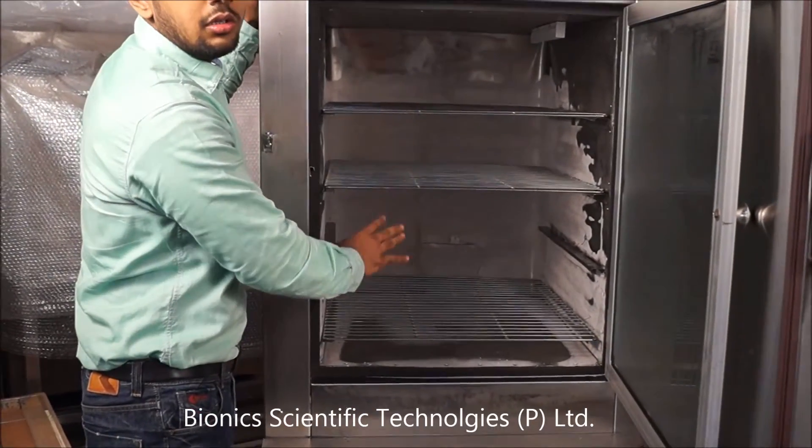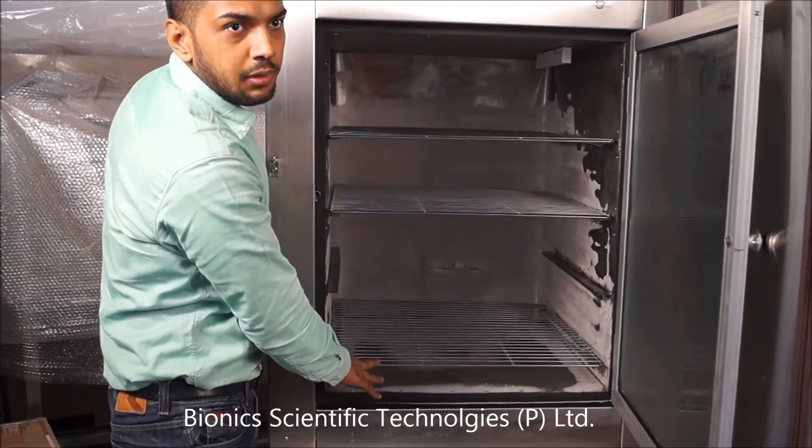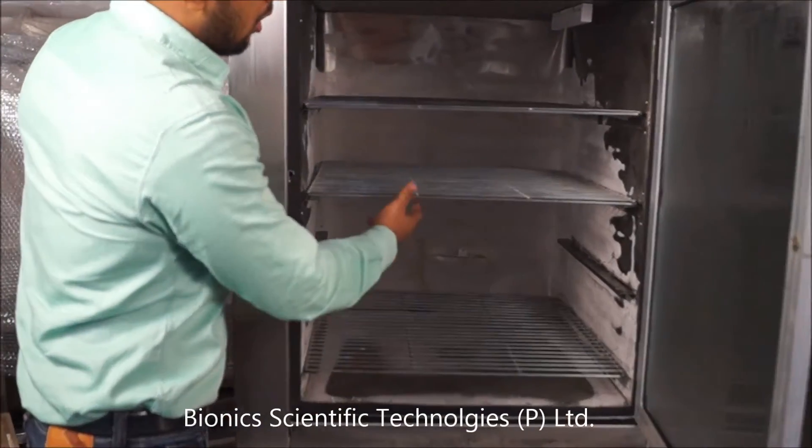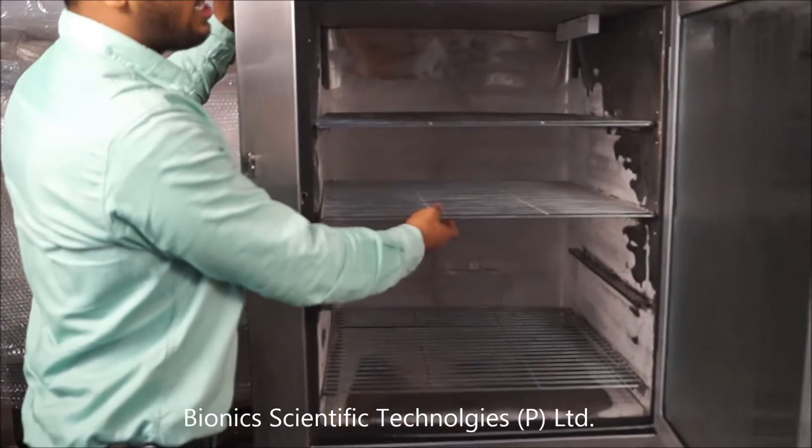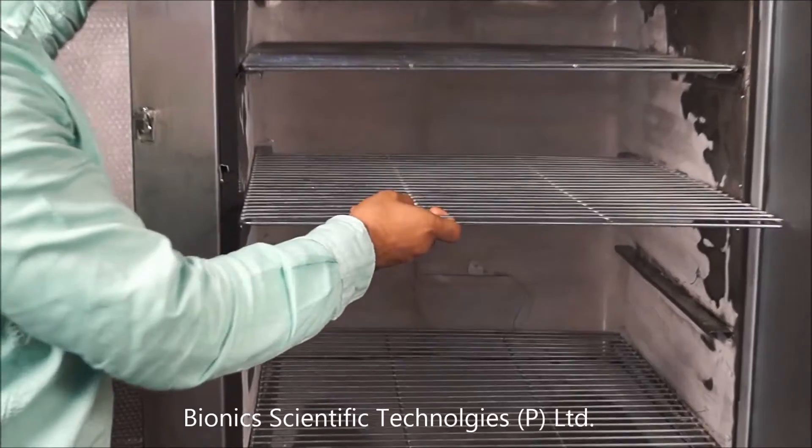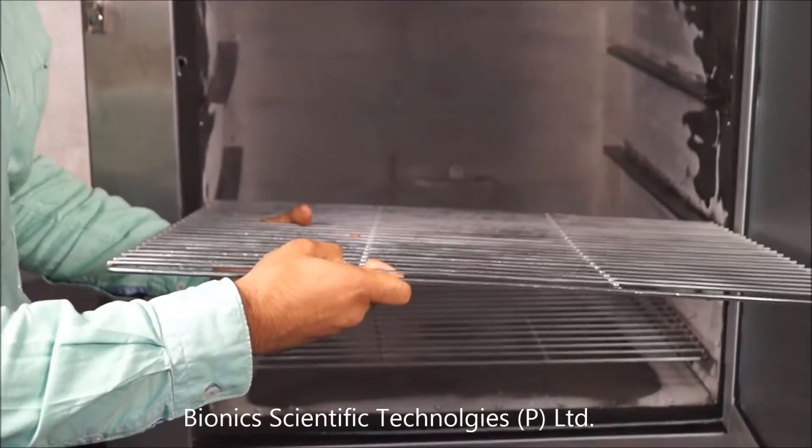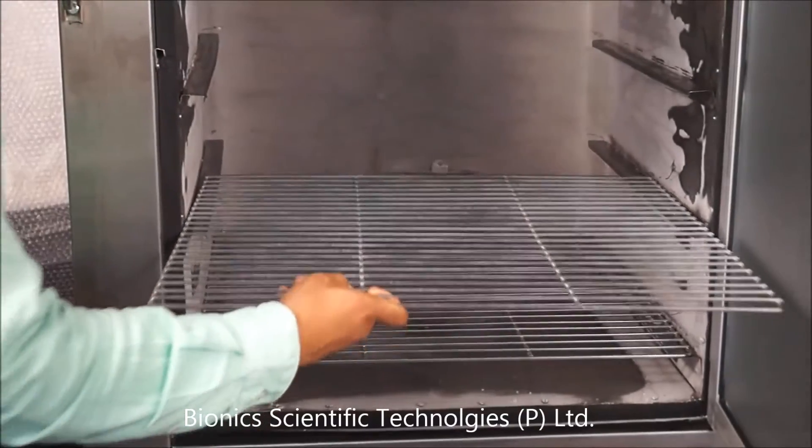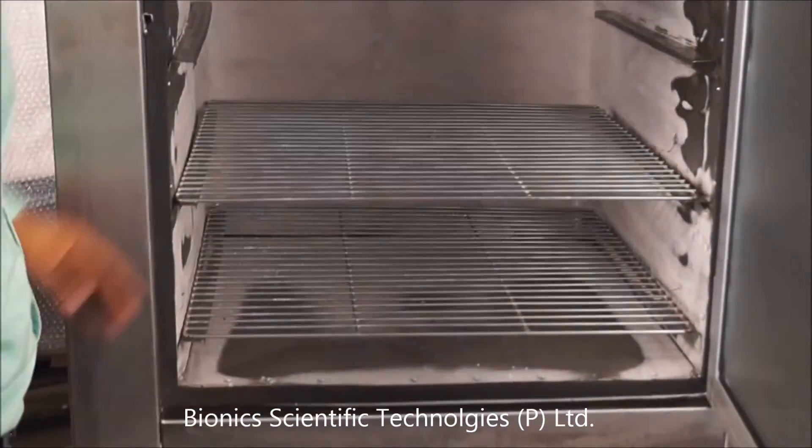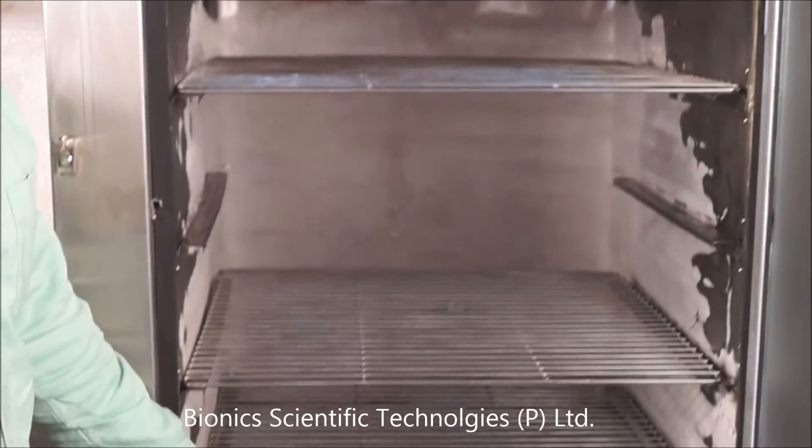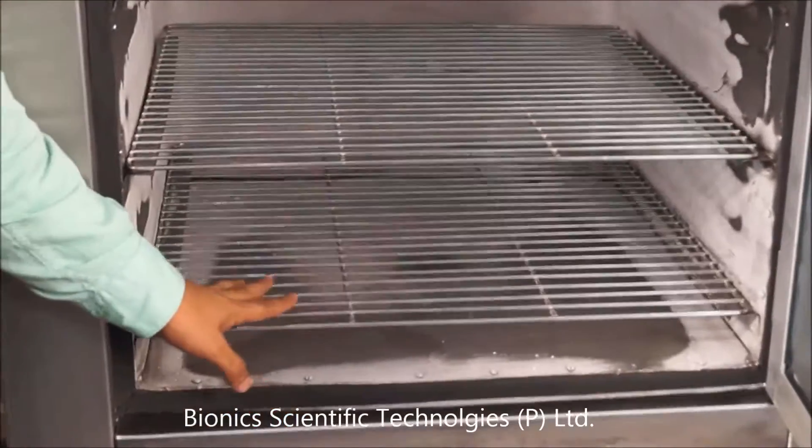There are three shelves in this chamber. These three shelves are adjustable according to their height. You can adjust them like this as per your requirement. These shelves are completely made up of stainless steel.